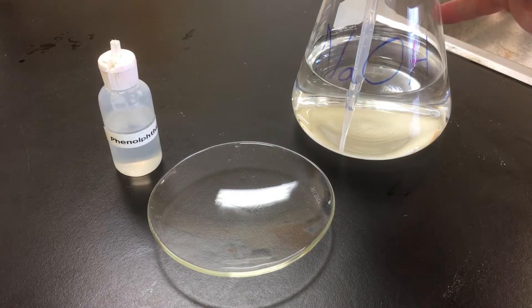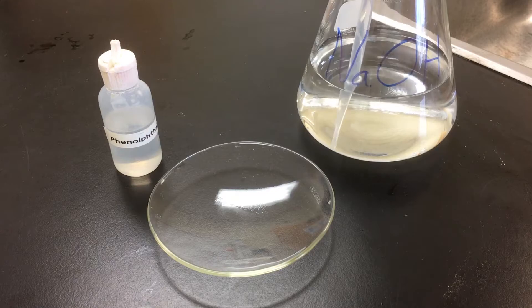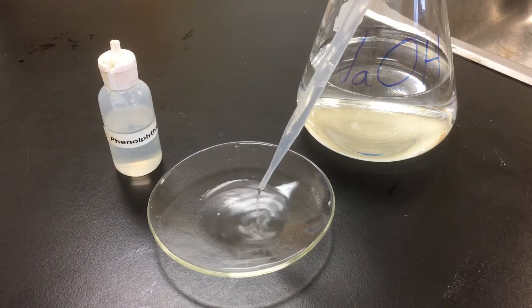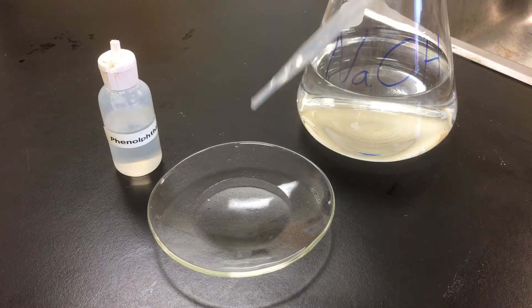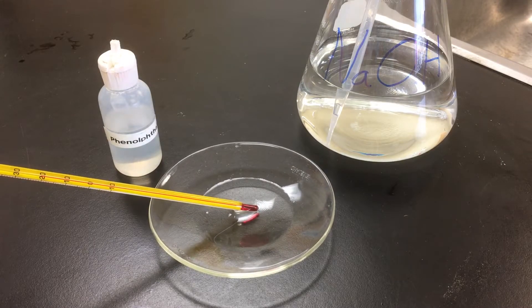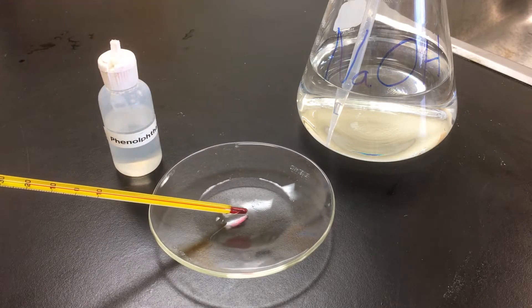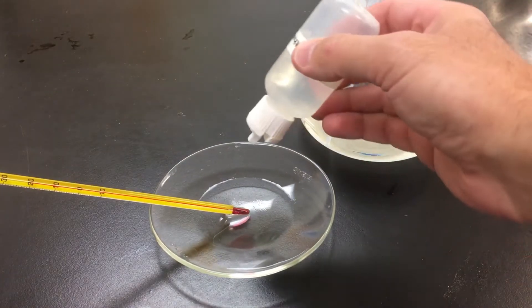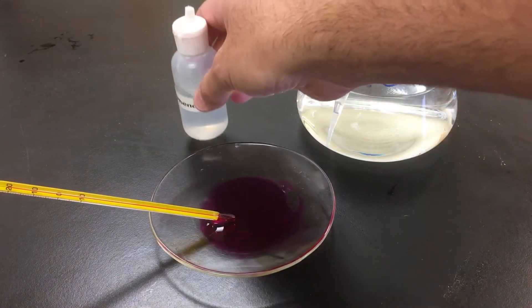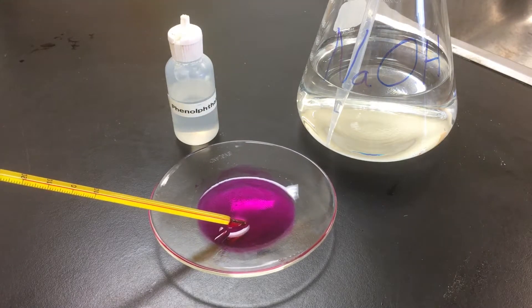Pair four: once again we have sodium hydroxide solution, which is clear. We put some in the watch glass, with an initial temperature of 20 degrees Celsius. We add phenolphthalein, and we can see there is an immediate color change to purple. There is no significant change in the temperature of the solution.